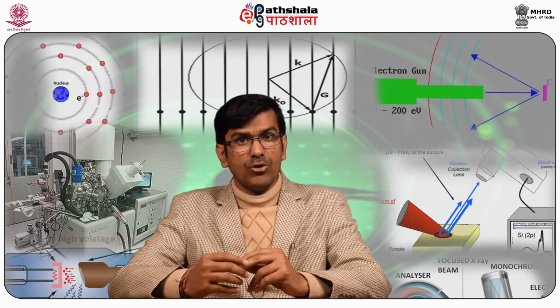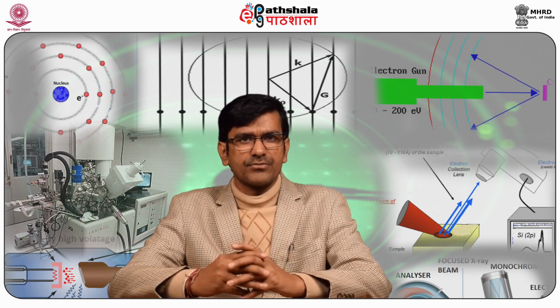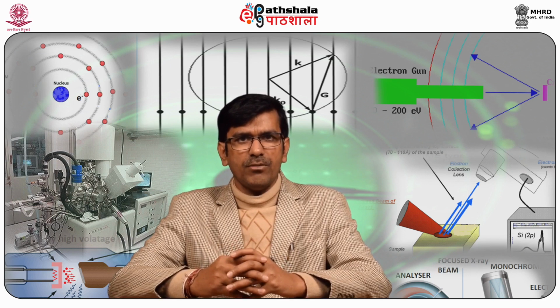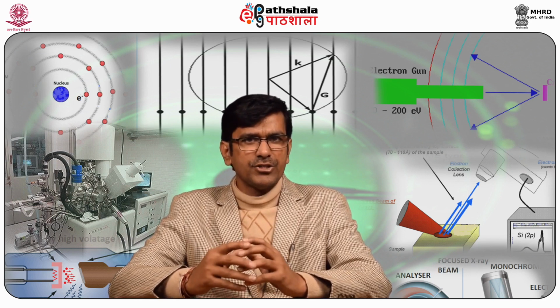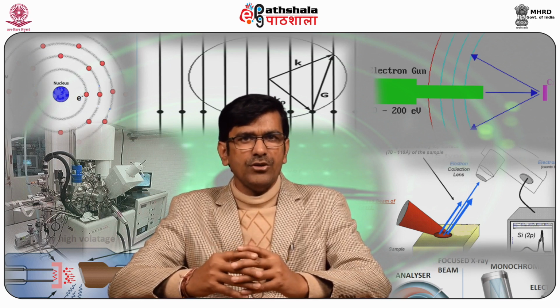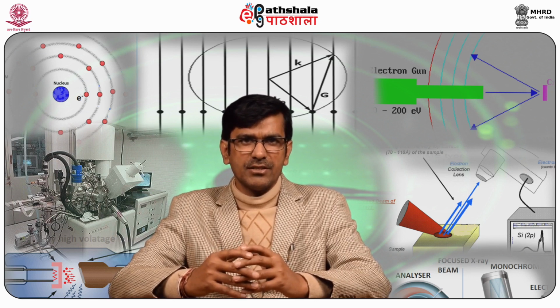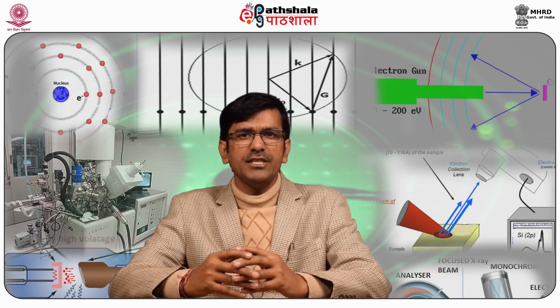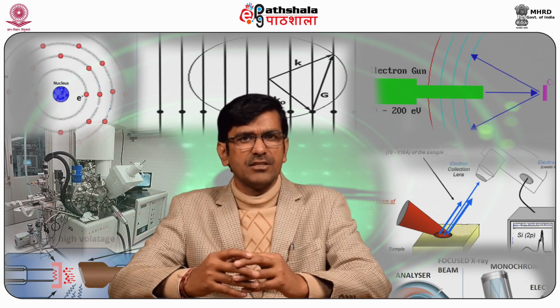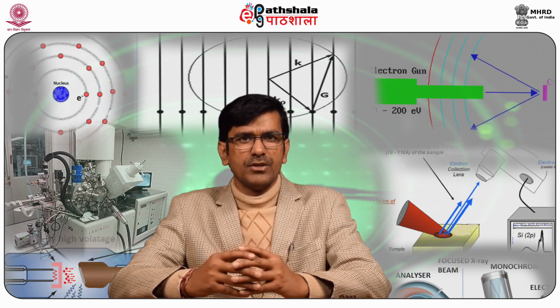Finally, it is most valuable to deconvolute the spectral data. The major problems that beset the deconvolution are knowledge of the line shapes and the background, which are often quite difficult to ascertain with precision. Nevertheless, deconvolution is a necessary element of data analysis, particularly in X-ray photoelectron spectroscopy.